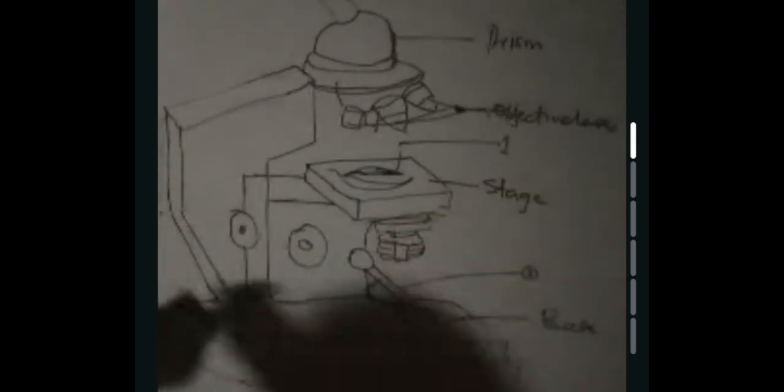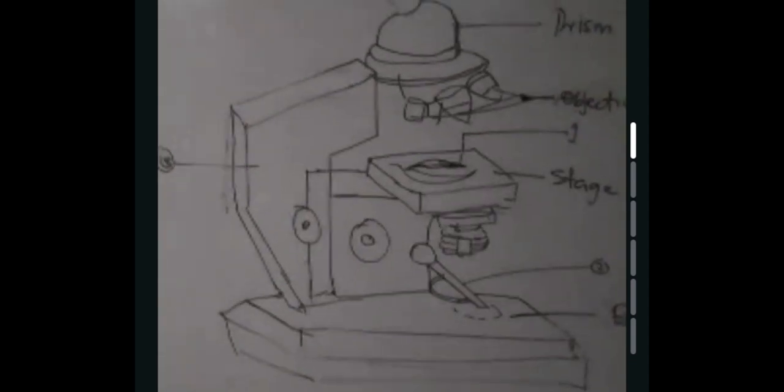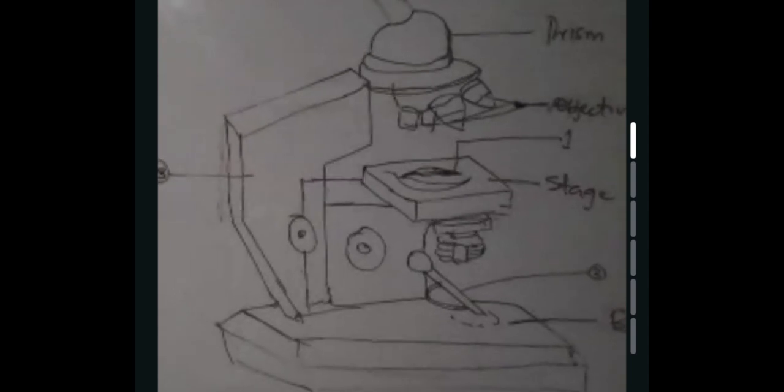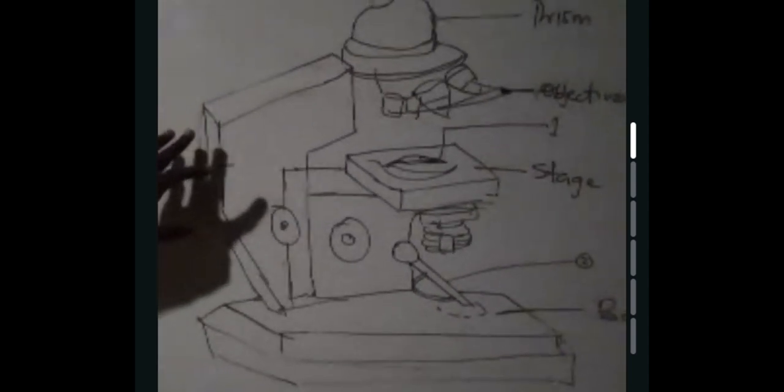Okay, who is telling us this one? I'm labeling something here. What is this one? Let me label it as 3. Who is going to tell me number 3? What's this 3? Okay, Naomi. It's called the arm. So this one is the arm of the microscope.